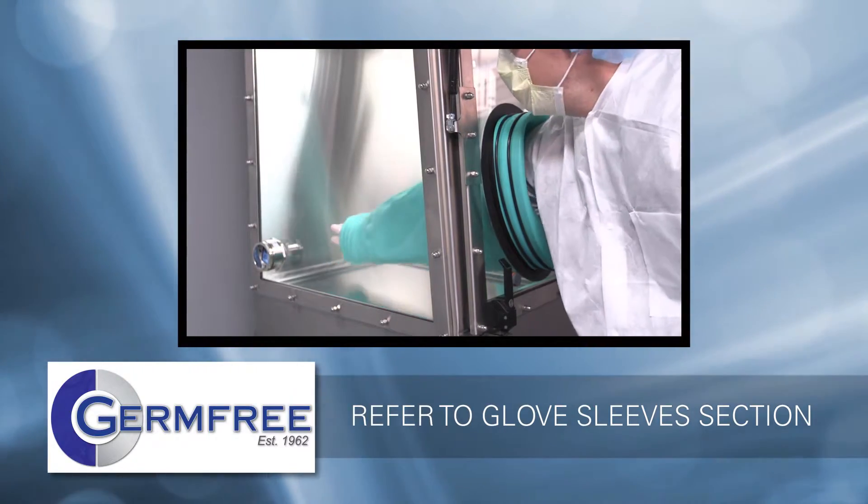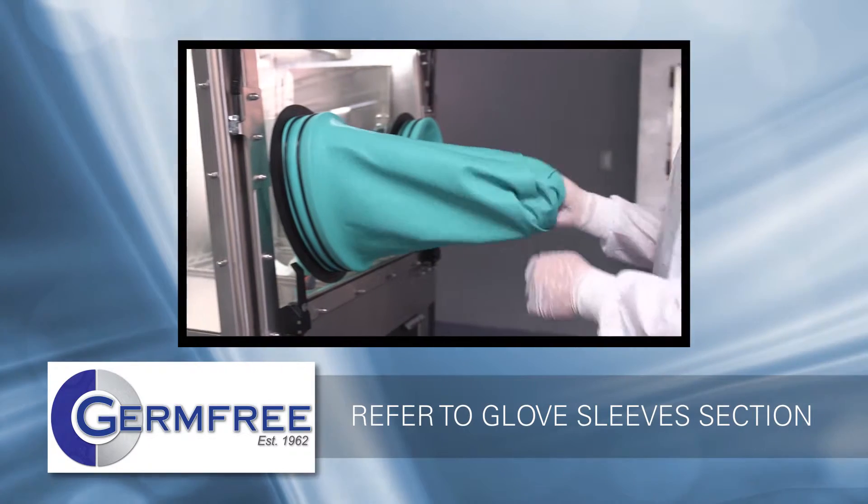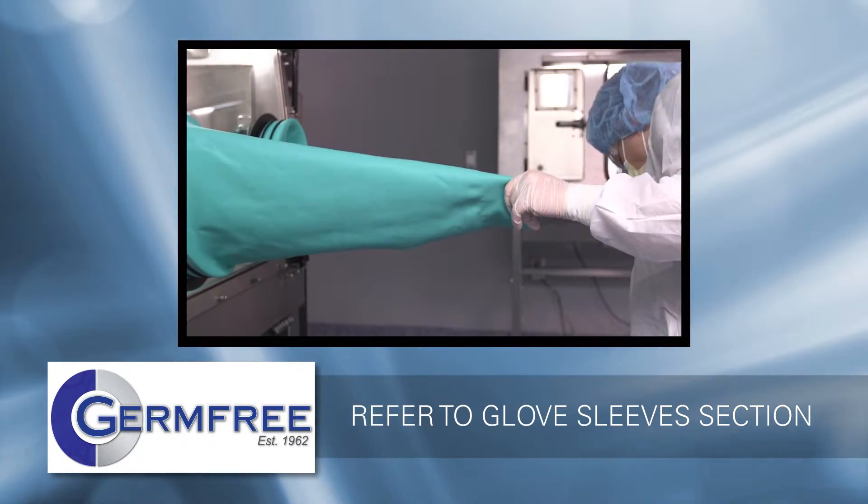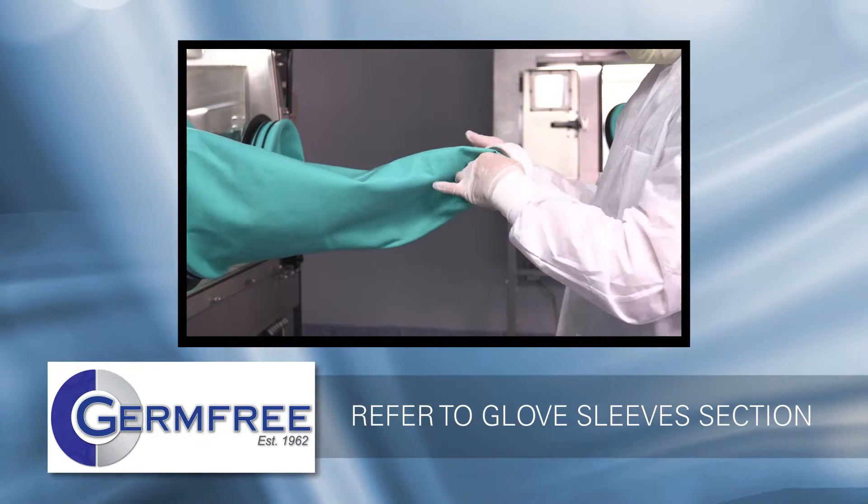Place the rubber stoppers into the sharps and waste tubes in the interior of the isolator. Next, install the glove sleeves. For a detailed explanation of glove sleeve installation and replacement, please refer to the glove sleeves section of the video.